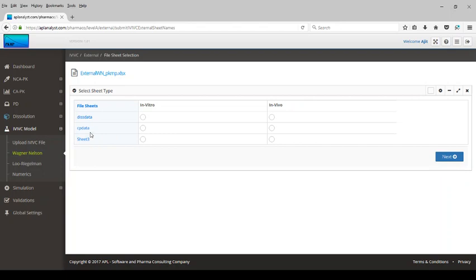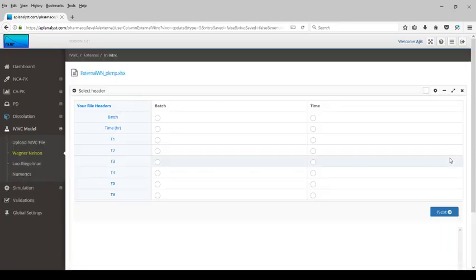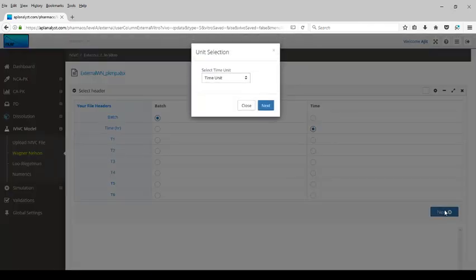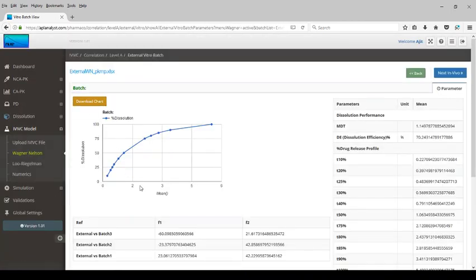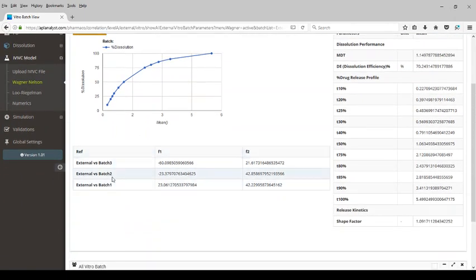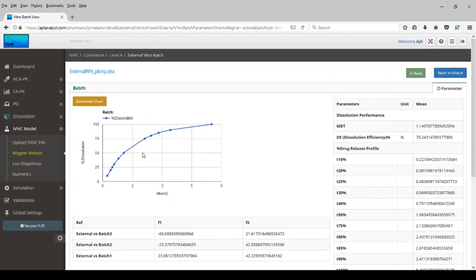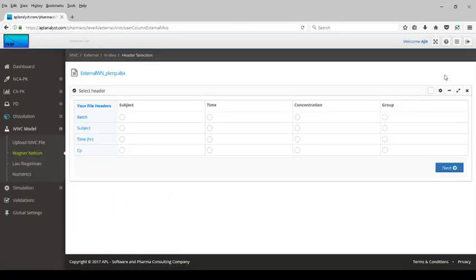In this external batch, we have the dissolution data. We map the file headers to the program-required in vitro variables, and the CP data is the in vivo data. Click next, select batch for the batch grouping, and set the time unit to hours. The dissolution data for the external batch is displayed, and the dissolution analysis along with batch comparisons for batches 1, 2, and 3 is computed.